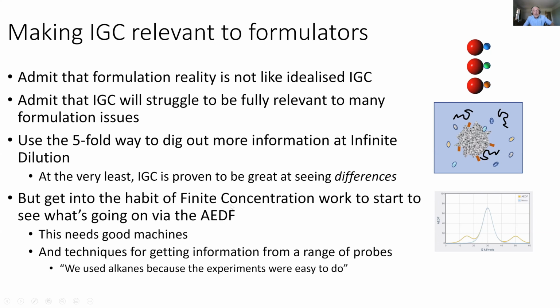But get into the habit of finite concentration work to start seeing what is needed, to find out more about the AEDF. This does need good machines. It does need a bit of bravery. To say we used alkanes because the experiments were easy to do is true, but not helpful. We as a community need to get into the habit of using more different probes. It's harder. Eric has told me how hard it is, but that's not an excuse. We have to solve these problems. And once we do that, we will get much more information about making IGC relevant to formulators.